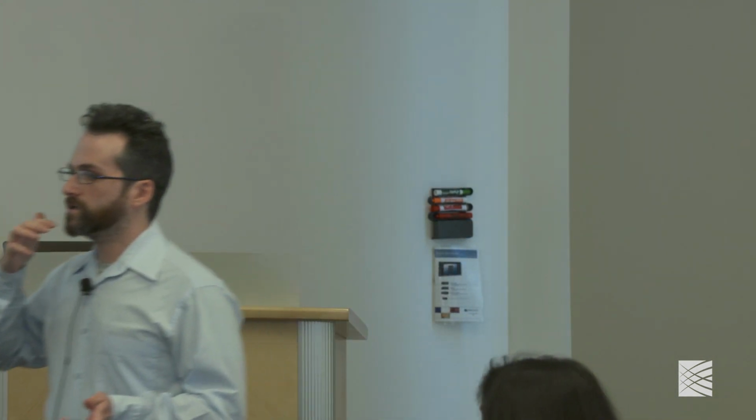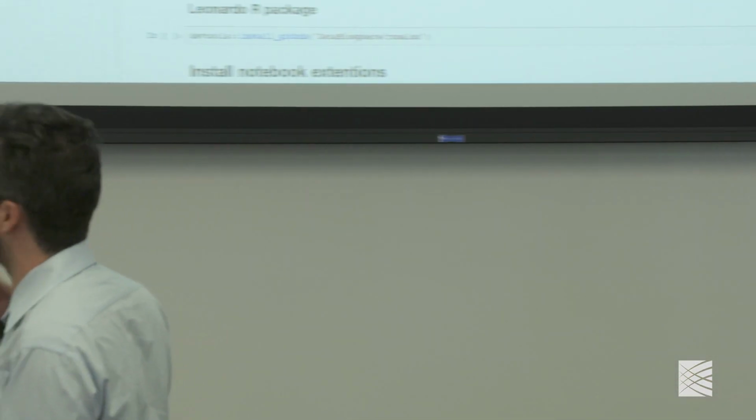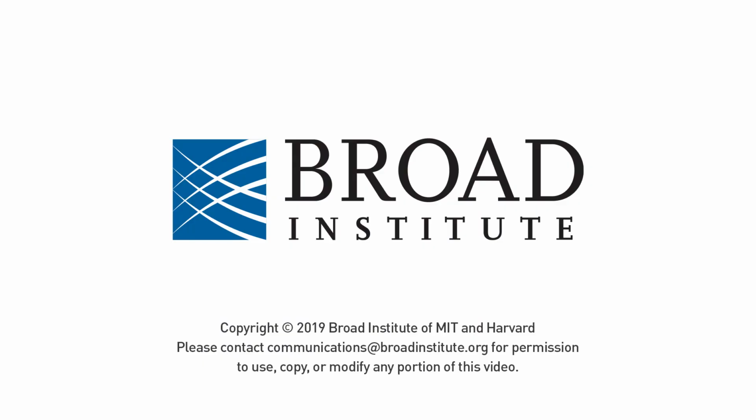Oh darn. Should we be clicking on create cluster to edit? Yes, on the top? Yes, if it asks you for that option, then yes. If it prompts you for that.